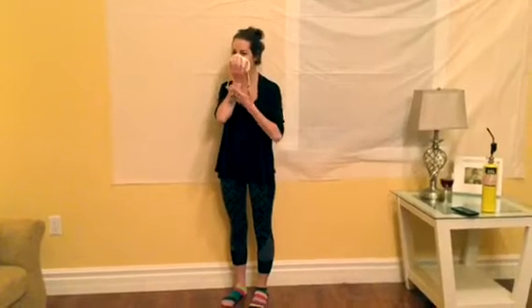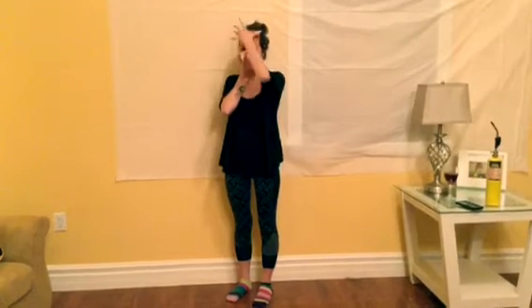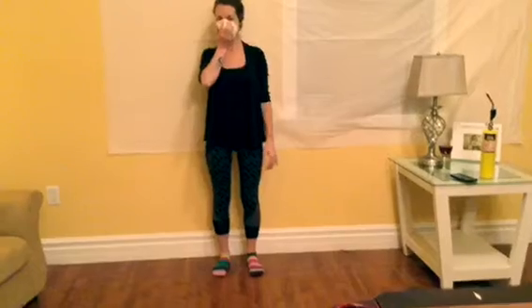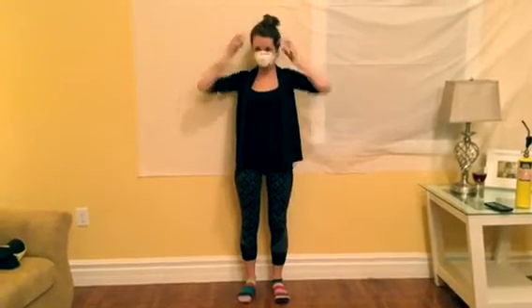Continue holding the mask in place. Pull the bottom strap up over your head and position it below your ears. Then pull the top strap up over your head and rest it high on the back of your head. If you have long hair, the straps must be positioned below the hair. For proper placement, untwist the straps and position the mask low on your nose. Using both hands, mold the nose piece to the shape of the nose by pushing it down and out.